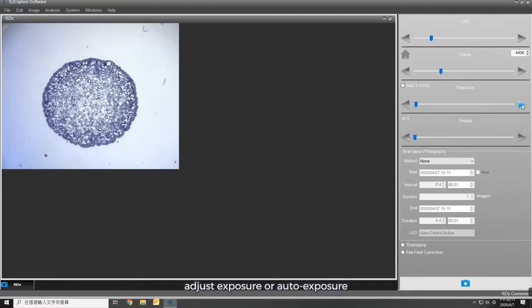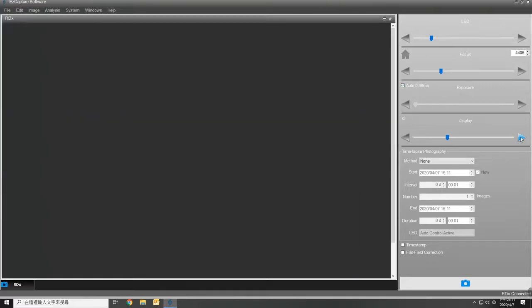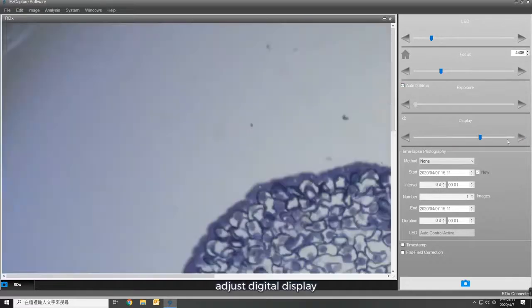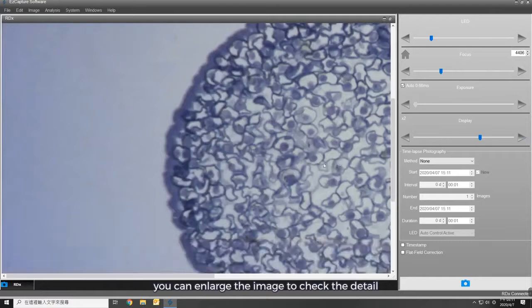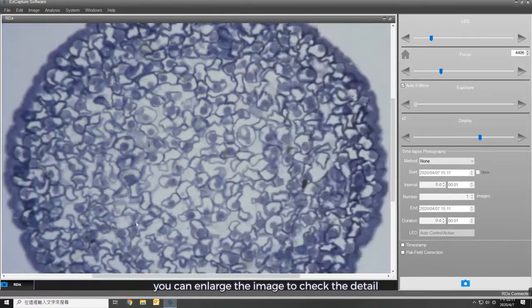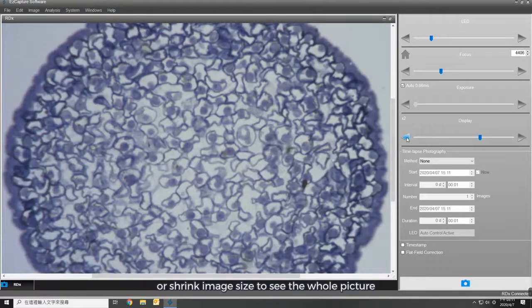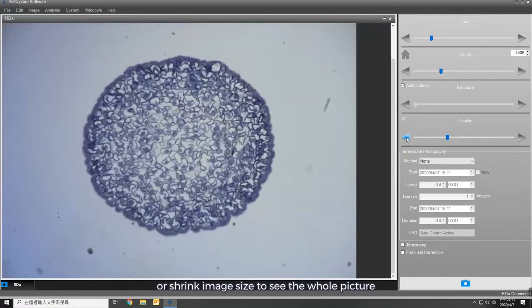Adjust exposure or auto exposure. Adjust digital display. You can enlarge the image to check the detail or shrink image size to see the whole picture.